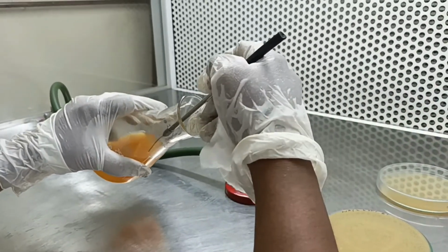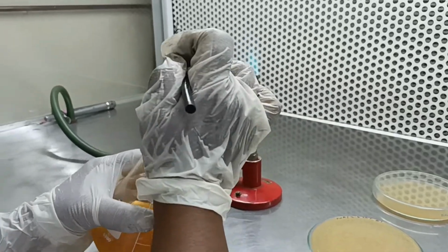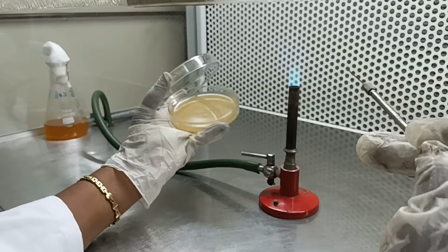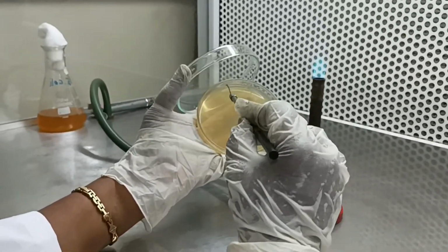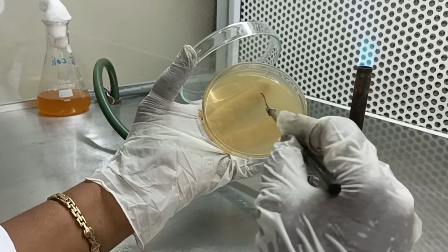The next one, zigzag streaking. This is simple streaking. Take 1 loopful of inoculum from the broth. Place the inoculum on the top of the agar surface. Just streak 2 or 3 times and continue to track the loop in a zigzag formation.